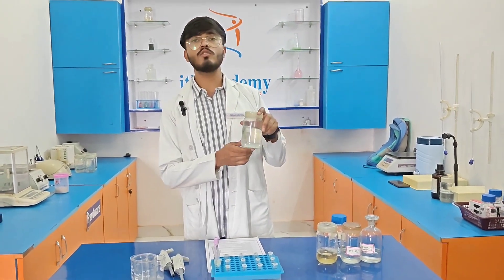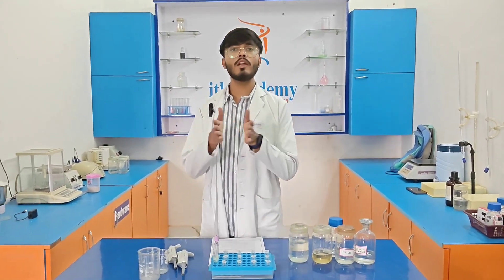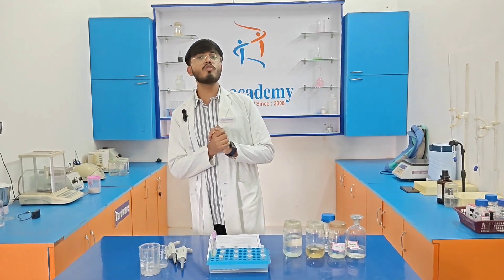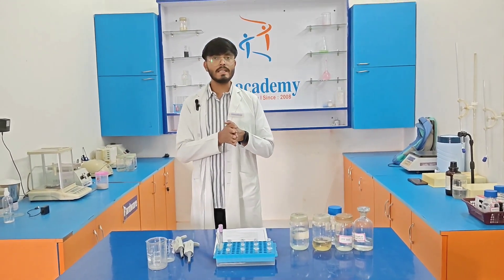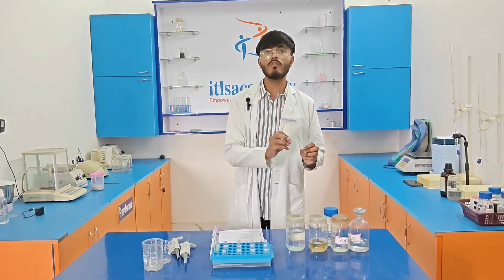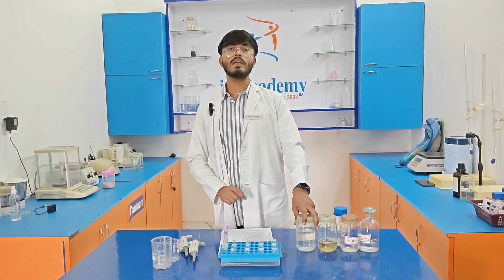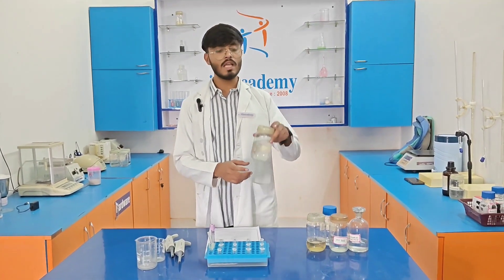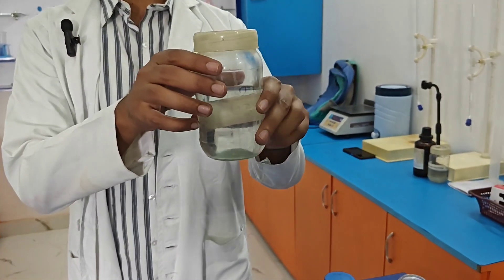We prepare this protease buffer solution in 50 ml, dividing it into 25 ml and 25 ml. First, we dissolve the solutes in 25 ml of distilled water and maintain the pH at 8, then add the remaining 25 ml of distilled water to give 50 ml of protease buffer solution.